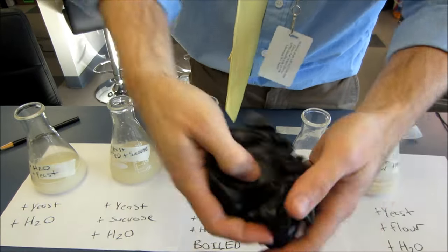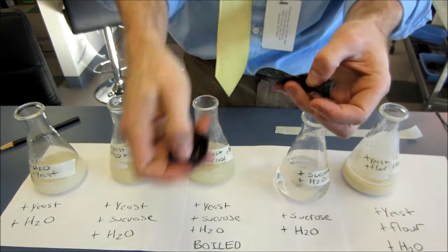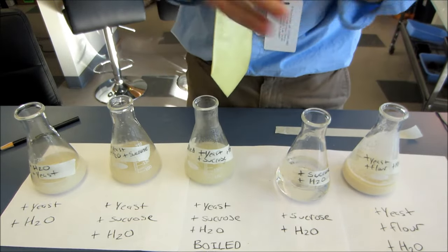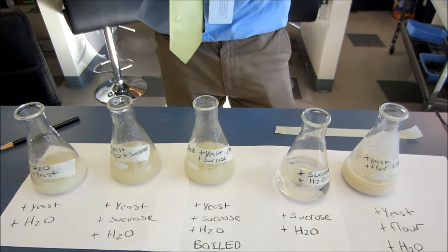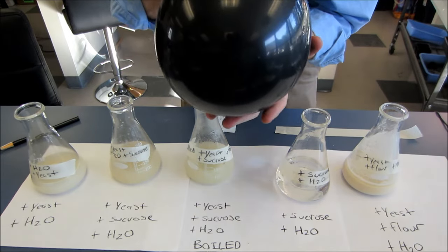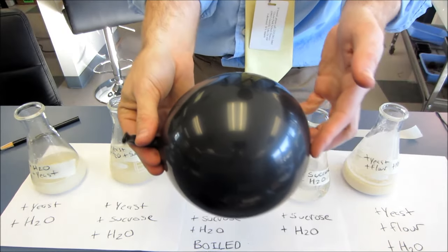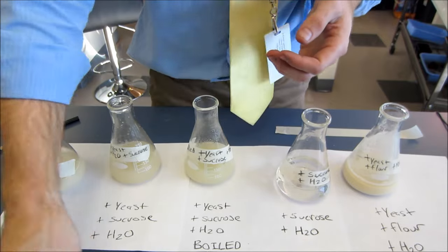We're not really caring too much about really precise data on this one. I just want a demonstration that you can see easily, so I'm going to capture it in these balloons. You can see the balloons. They're all the same type, same brand, even the same color. Trying to control for as much as possible here.